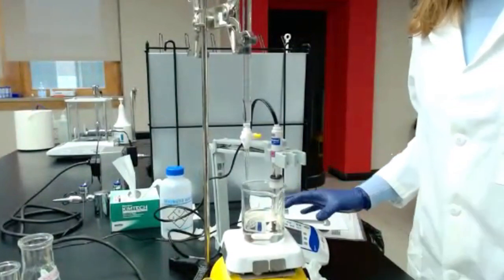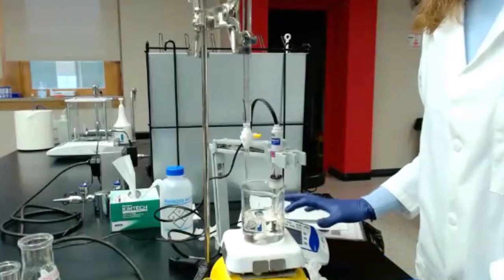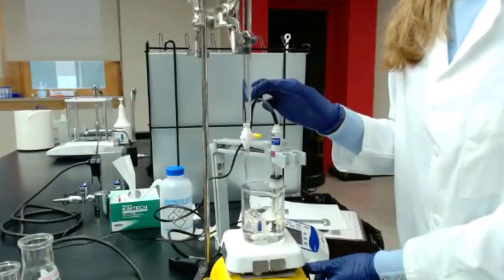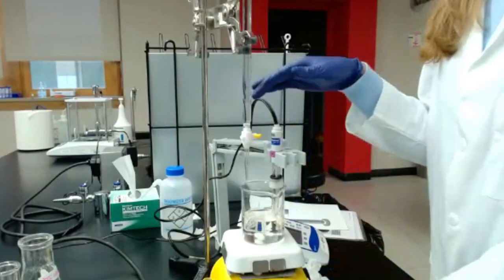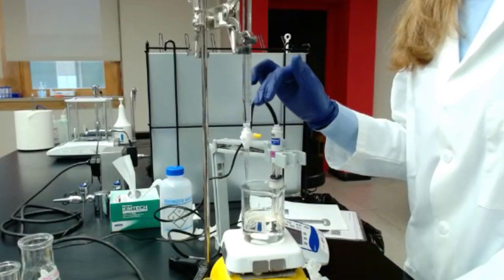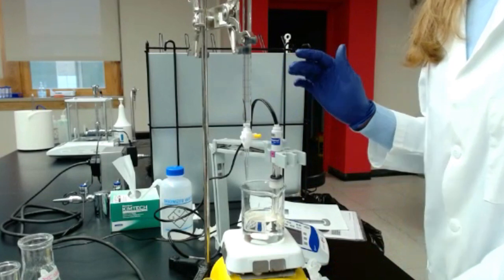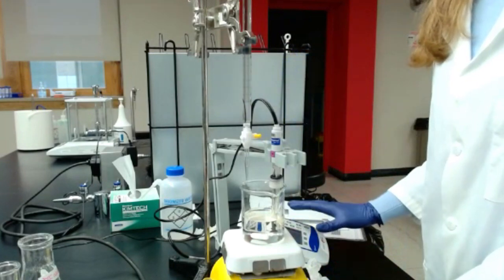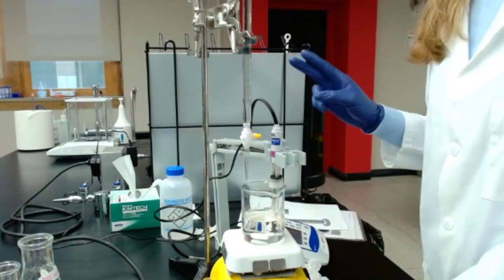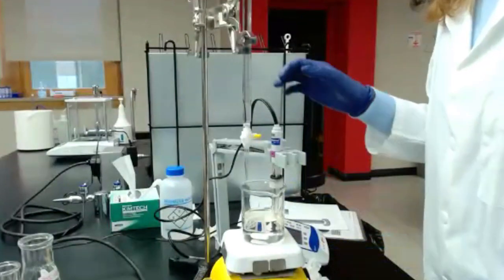Now we're going to start. Make sure you stir your solution and you look at the pH. The goal now is to start the titration. I'm stopping because it goes so fast, but the goal is to add sodium hydroxide slowly until we reach a pH of 8.2. That can go fast. As soon as you reach pH 6, it might be very fast. In just one drop, you might have pH 8.2.